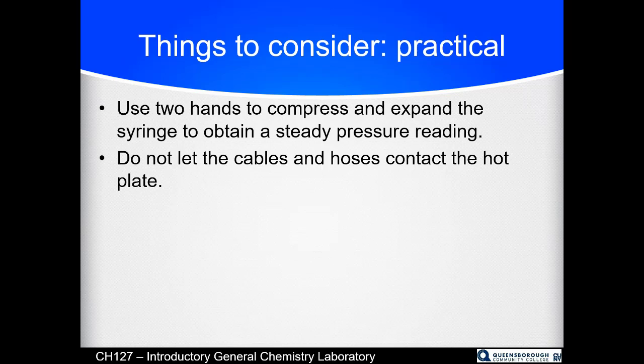In part 2 of the experiment, really please make sure that the cables and hoses do not touch the hot plate, because they will melt. It will smell bad, and you will ruin the equipment.